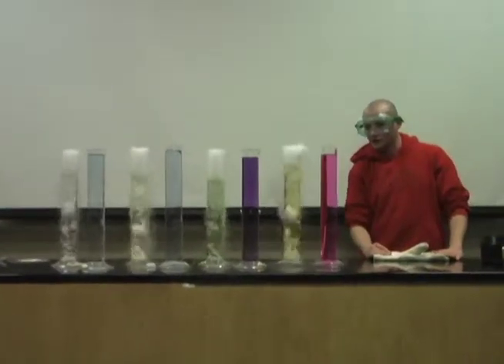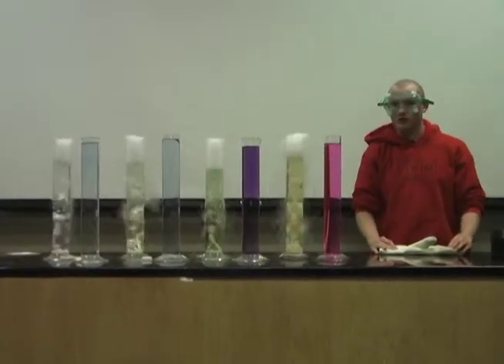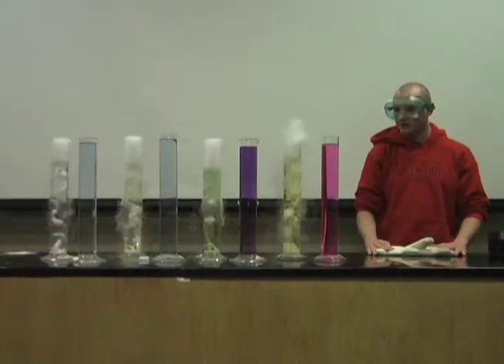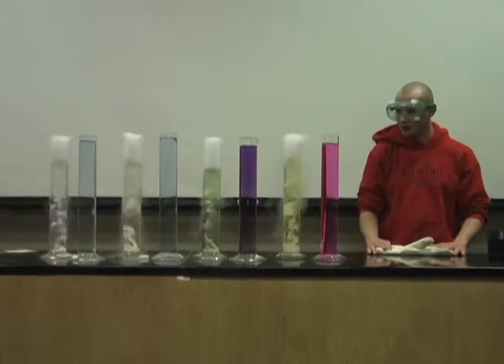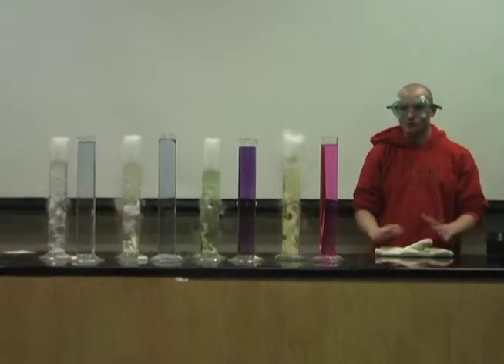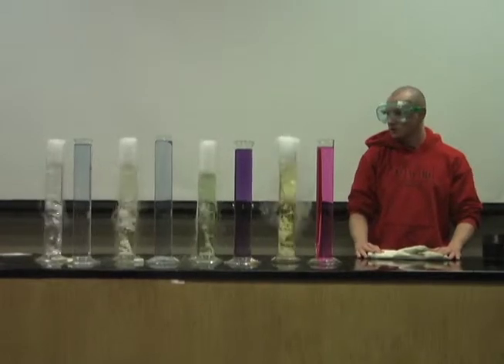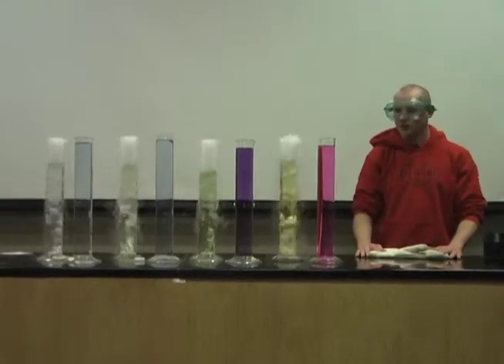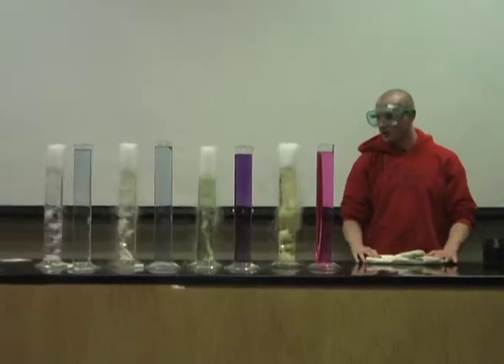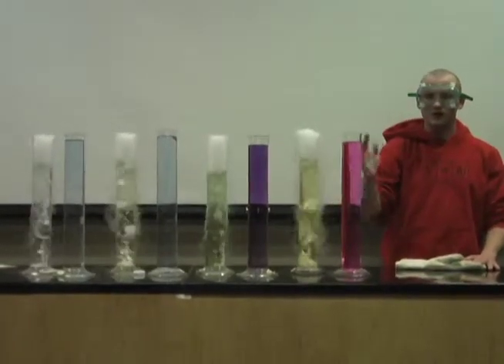When the dry ice, which is solid CO2, is added into the water, it forms carbonic acid, which is a weak acid and will react with the base in the water, the hydroxide. We started off with 6 molar ammonium hydroxide, and they will neutralize each other, and if there's an excess of CO2, we form an excess of acid, which will turn our pH more acidic and will lower it by much more. And that's why we see the color changes, which are very distinct between their acidic pH and their basic pH.